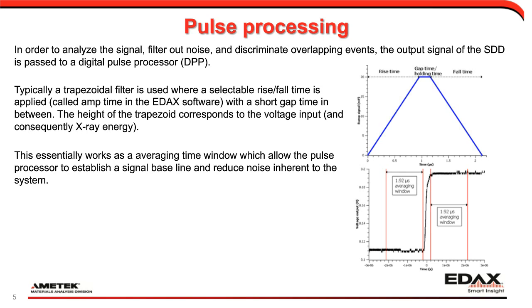This is why we can discriminate the low sensitivity signals, or the low X-ray signals, because we average out and establish the baselines for the noise so we can get a nice discrimination of the actual peak height when we get the voltage jump.